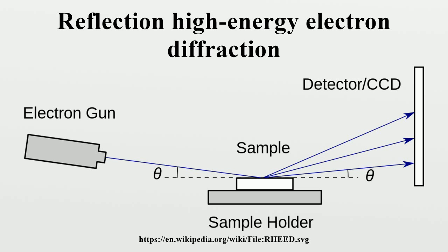Figure 8 shows an example of the intensity fluctuating at a single RHEED point during MBE growth. Each full period corresponds to formation of a single atomic layer thin film. The oscillation period is highly dependent on the material system, electron energy and incident angle, so researchers obtain empirical data to correlate the intensity oscillations and film coverage before using RHEED for monitoring film growth.